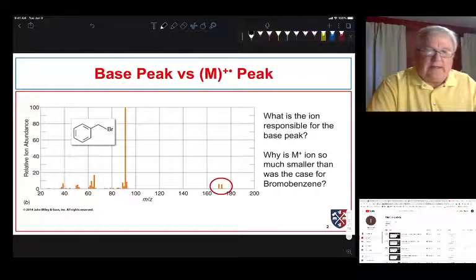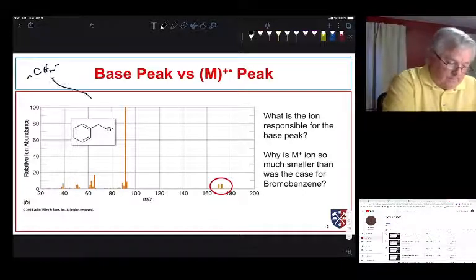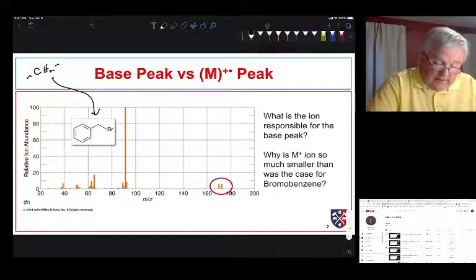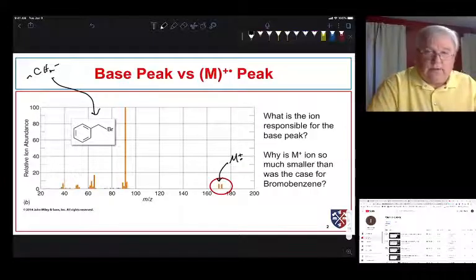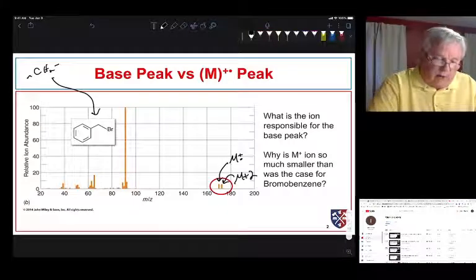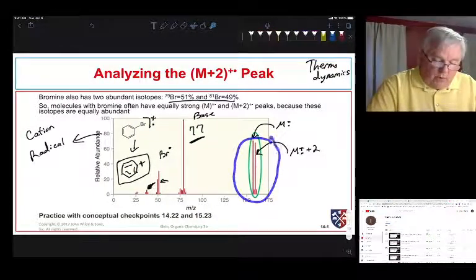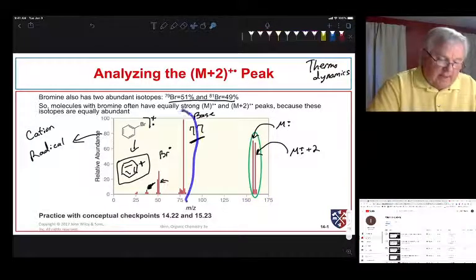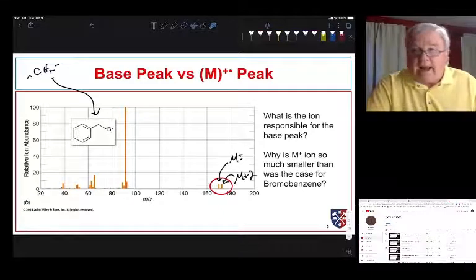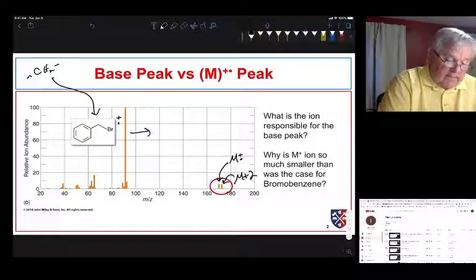This is bromobenzene. Now let's look at benzyl bromide — the difference is there's a CH2 group in between the phenyl and the bromine. That changes the molecule quite a bit. Here's our molecular ion peak due to the radical cation, and we see our M+2 peak indicative of bromine. But notice how much smaller this is relative to the base peak compared to bromobenzene.